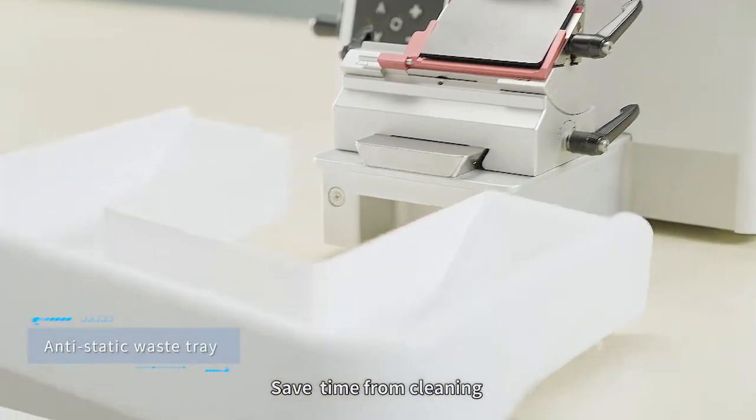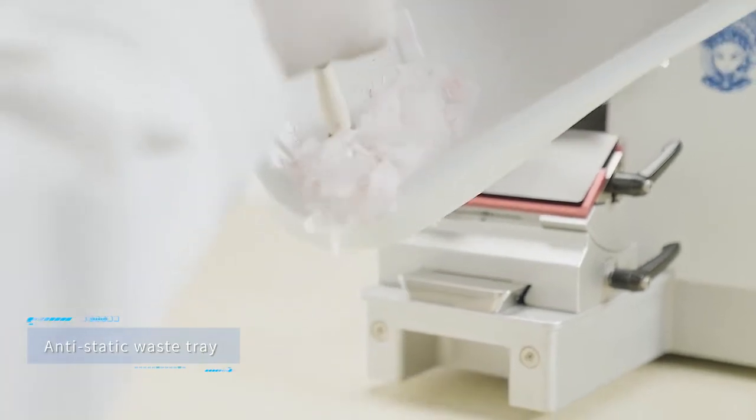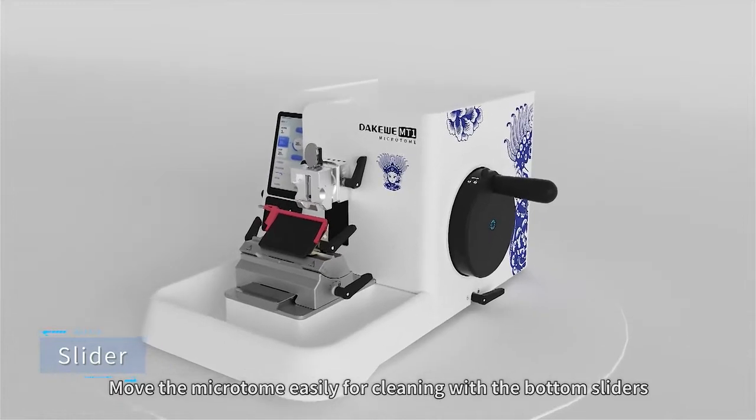Save time on cleaning with a large volume anti-static waste tray. Move the microtome easily for cleaning with the bottom sliders.